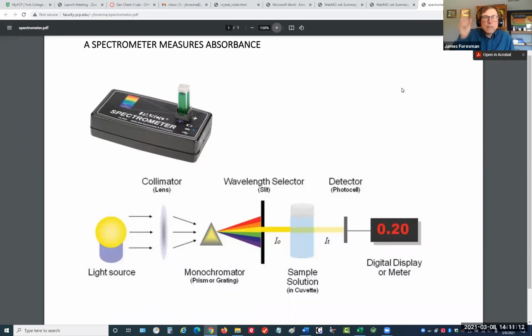How do we obtain the data? Well, if we were working in the lab this week, we would use a spectrophotometer. We would prepare a small sample in what's called a cuvette. We have glass versions of these and plastic versions of these. And you prepare a sample and you simply insert it in the device. And inside this device, there's a light source that's passing through a prism so that the sample can be exposed to specific wavelengths of the visible spectrum.